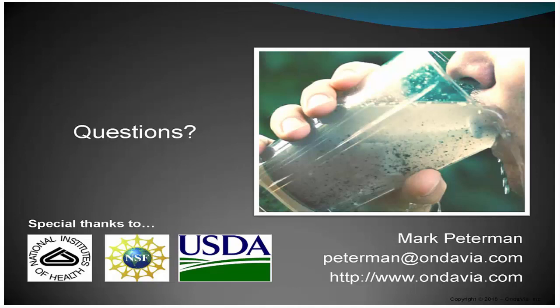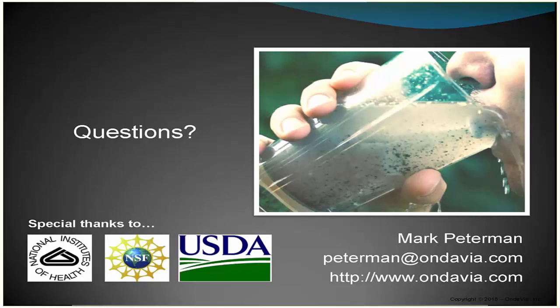That is our goal. It's kind of a new technology. It's picking the right places to start and the right applications. First and foremost, we know that all of our methods need to be as good as the laboratory, if not better, because if it isn't, then what is it, right? Where we will likely go first for approvals will be things like ASTM on some of the industrial side, and then use that as a springboard to look towards EPA or state level approvals for things like lead and arsenic and selenium. But we need partners there really to drive that forward, because the way you get those approved is you have data, right? And the more samples you put through it, the more confidence you have in the method, the better your data set, and the easier it is to get approved.